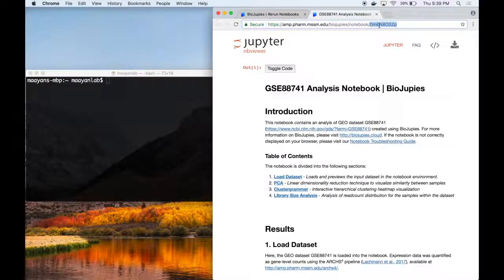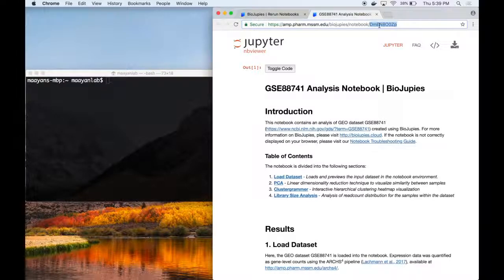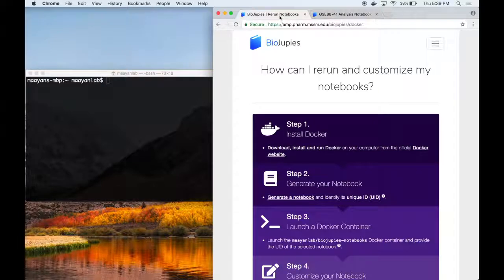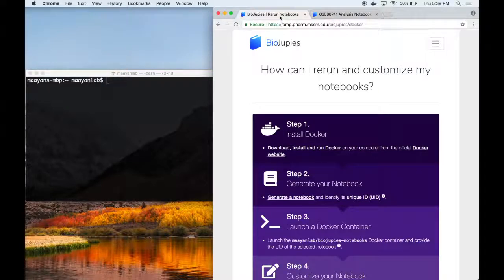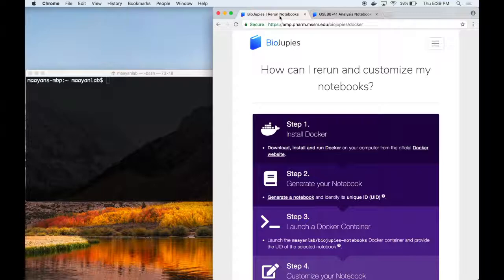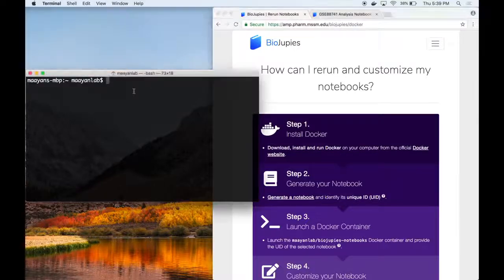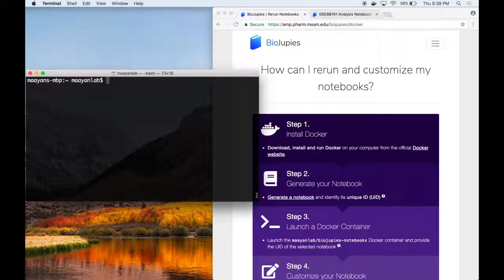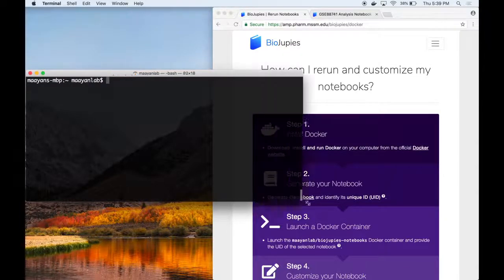Once you have identified the notebook you wish to rerun, you can launch the BioJupees Docker container, which will automatically download the notebook and launch a Jupyter server containing all the necessary software packages to rerun the full analysis on your local computer. If you're using a Mac or Linux-based system, open a new window in your terminal. Windows users can follow the same instructions by opening the Docker quickstart terminal.